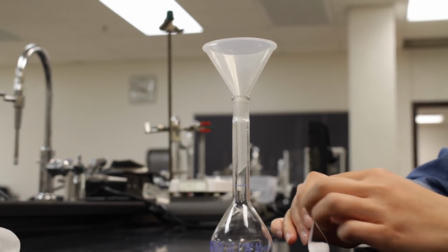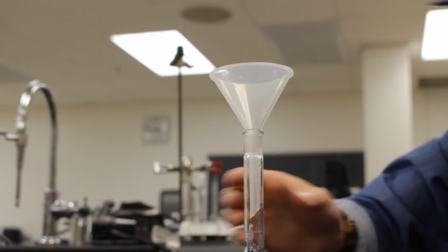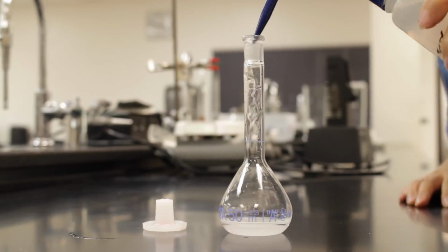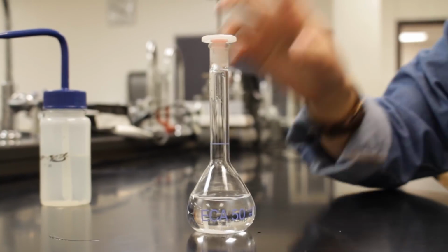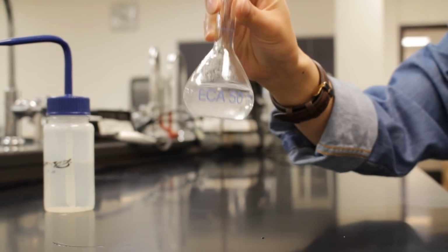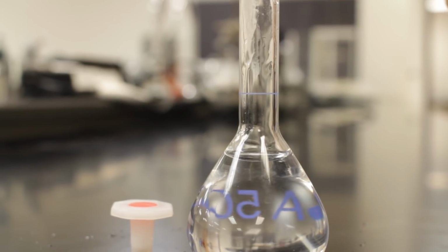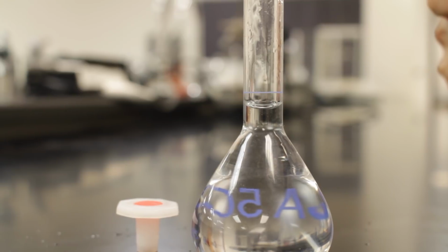Using a funnel, transfer the sugar into a 50 milliliter volumetric flask. Rinse the funnel with distilled water to wash any clinging sugar. Fill the flask about 3/4 full with distilled water. Cap the flask, invert, and shake well until the sugar is dissolved. After the sugar is completely dissolved, fill the flask with distilled water until the bottom of the meniscus sits on the tick mark.